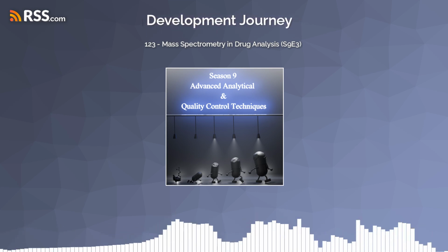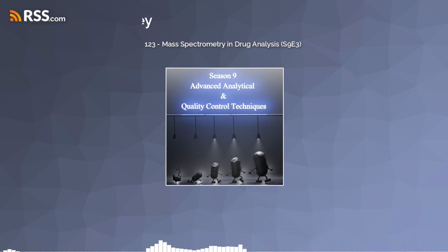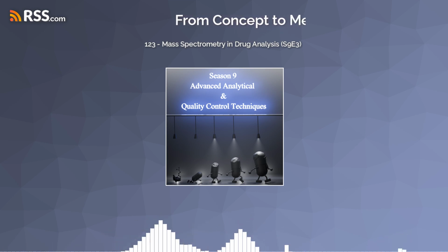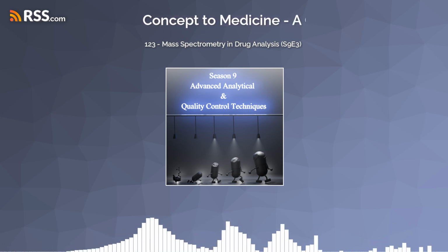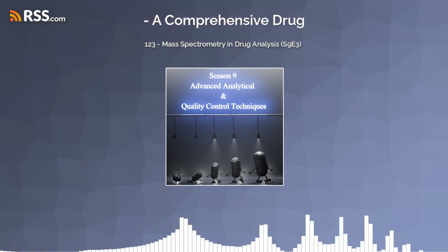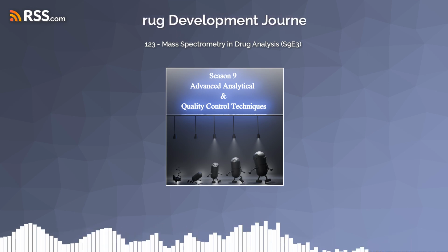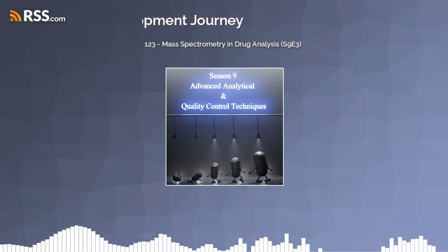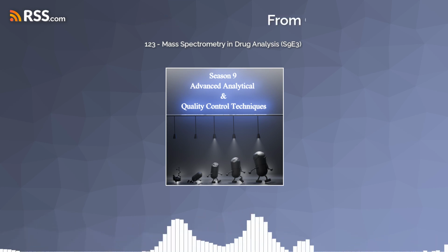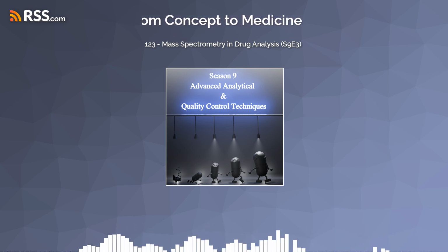Exactly. And later on, when they're scaling up production, mass spectrometry helps ensure that each batch of the drug is consistent. Oh, that makes sense. If they notice variations between batches, they can use LCMS to compare the impurities. This helps them figure out what might be causing the inconsistency and fix it. So it's really involved in every step of the way, from discovery to manufacturing, making sure that the drug is what it's supposed to be. Really interesting stuff. It is. It's amazing how this tool can help us understand the unseen world of molecules.